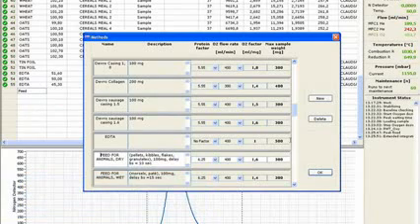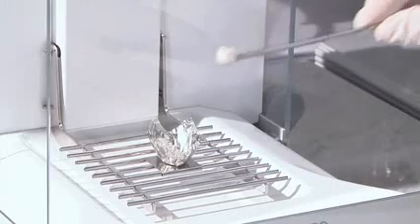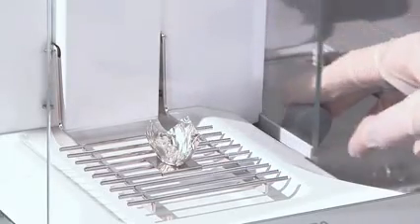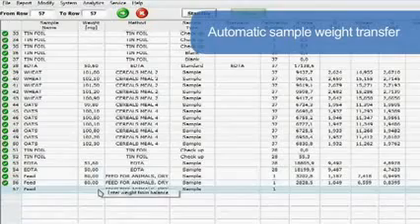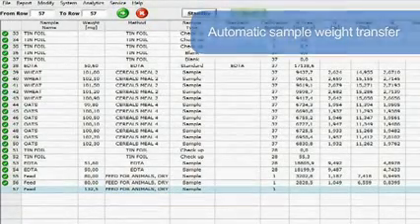The fully automated NDA701 is entirely controlled via PC through the intuitive Dumasoft software. The homogenized sample is weighed in a tin foil capsule, and the sample weight is automatically transferred to the dedicated Dumasoft software for increased convenience.